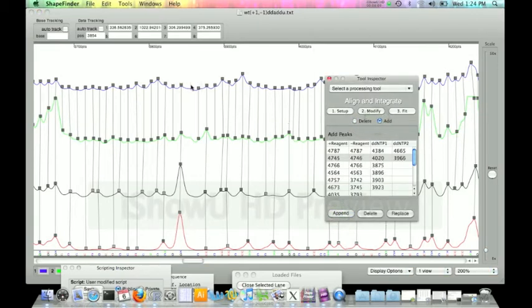So what I just did is I deleted that peak off there so I could change the spacing a little bit to help me add in that extra peak. So I'm just going to go ahead and put this one here. You can see there's a little bit more of a gap now. I made a little bit of space. Our shift is still there because I only added back the peak that I already took out. So again, I need to add in an extra peak to shift it back. So again, we'll add this peak in here.